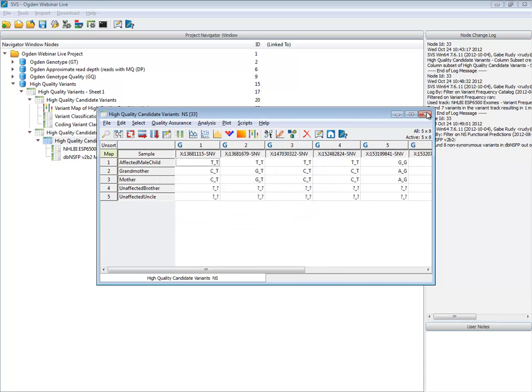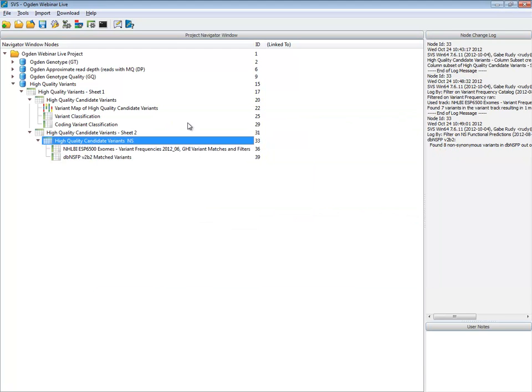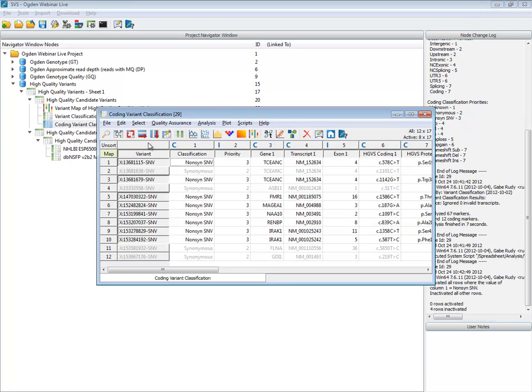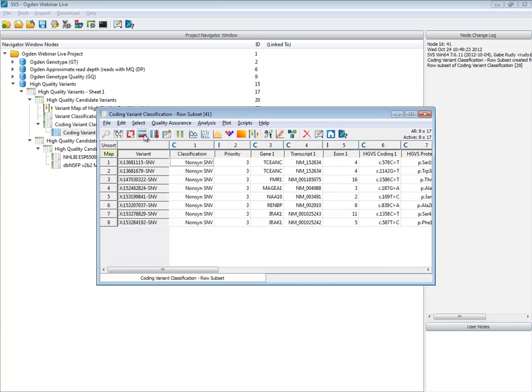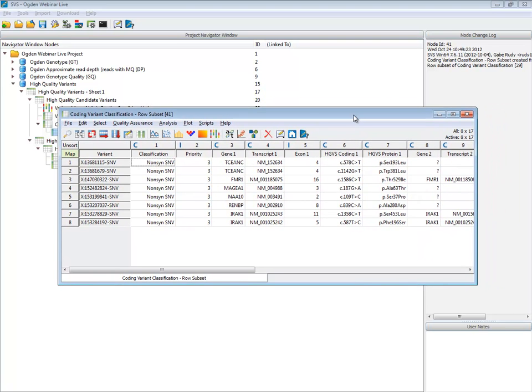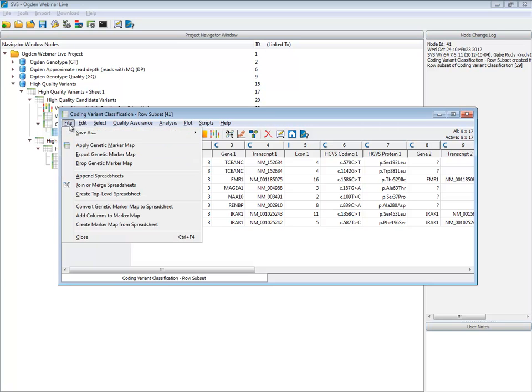So what I like to do from here is actually jump back to my coding variant classification report, create a spreadsheet here of just these 8 non-synonymous variants. Because this has that information about the gene, the transcript, and the protein changes in it, let's use this as an aggregation of our annotations for our remaining candidate variants.